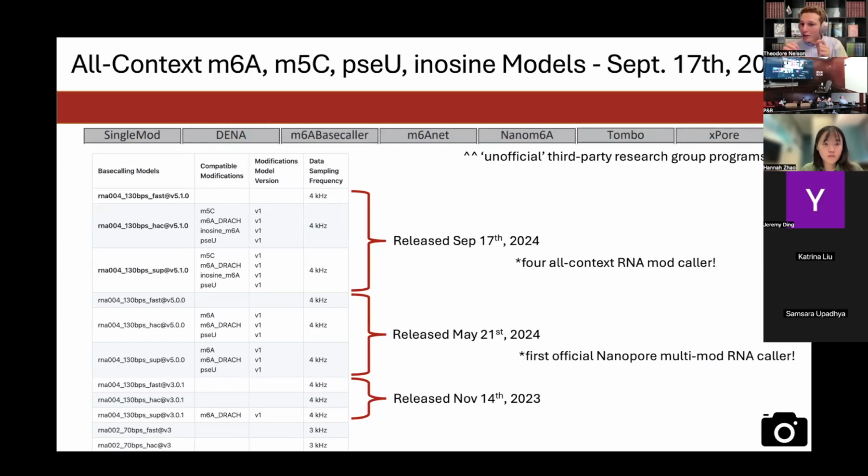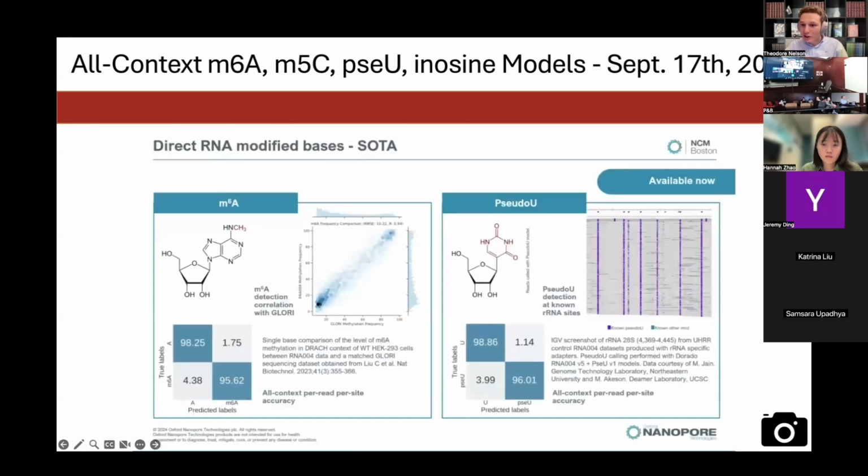And it's very exciting to just jump in and look at all the data and look at all the different contexts and differences. But before you can get to biology or novel biology, you always have to ask the question, what kind of technical benchmarking do I have to do first to see whether this works for the kinds of questions that I want to ask?